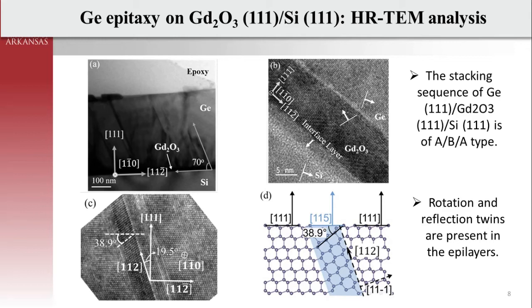Okay, here the epitaxial relationships and defect structures were further analyzed, mainly because you can see them directly by your own eye using HRTEM. Basically, this is a cross-section TEM. The image recorded over a large area of the sample shows a high density of stacking faults or twins and threading dislocations.